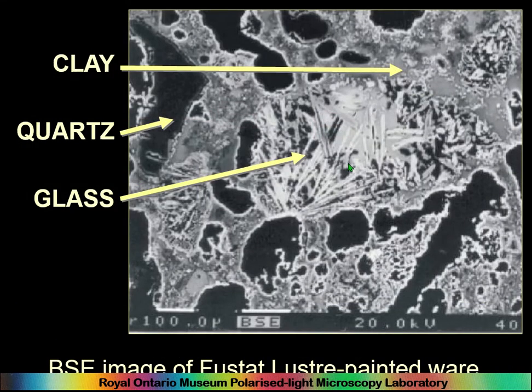And so what I think happened is they started playing with the fabrics. And so this is the earliest of what looks like the beginnings of stone paste. And here, this thing here is actually an inclusion of glass. What happens when you add glass to this matrix is that crystals grow within it, wollastonite and enstatite and things like this. And also in here is quartz. This dark thing is quartz.